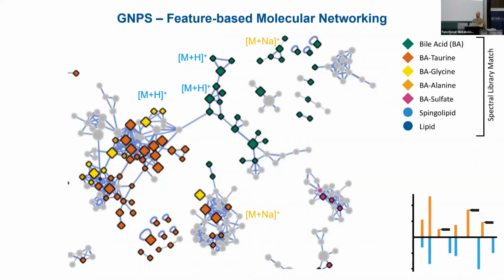Also, to add, there's a ton of possibility to organize your network in Cytoscape. And I love that software too, so thanks a lot to the Cytoscape developers for making this. There you can have different organization schemes of your network. You can do force-directed layouts, but you can also do other layouts. You can organize this in circles, which may be helpful to better visualize chemical complexity or whatever question you have. We're going to get a little bit into that in the last session today, and then in another one on Friday. So hopefully we'll give you a good intro to Cytoscape this week as well.